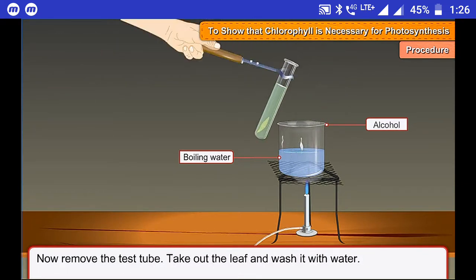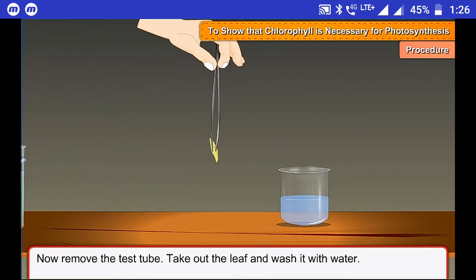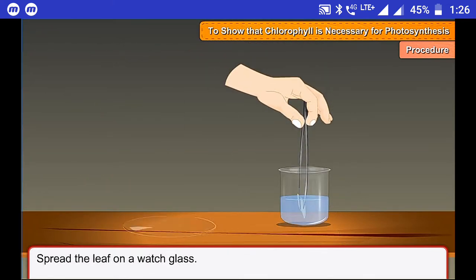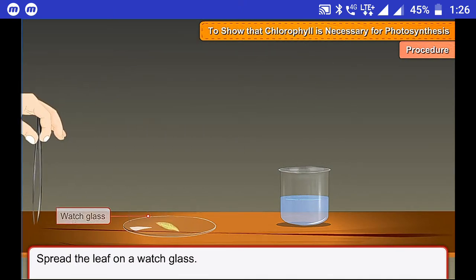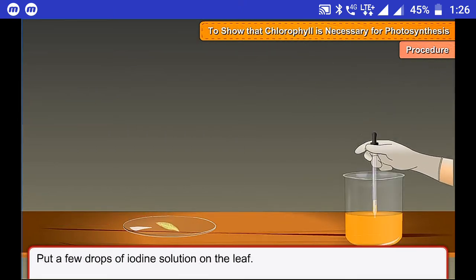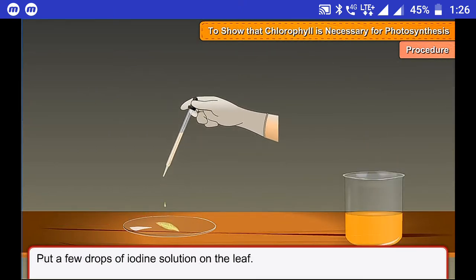Now remove the test tube. Take out the leaf and wash it with water. Spread the leaf on a watch glass. Put a few drops of iodine solution on the leaf.